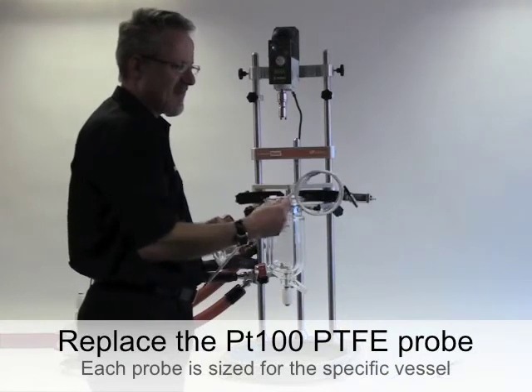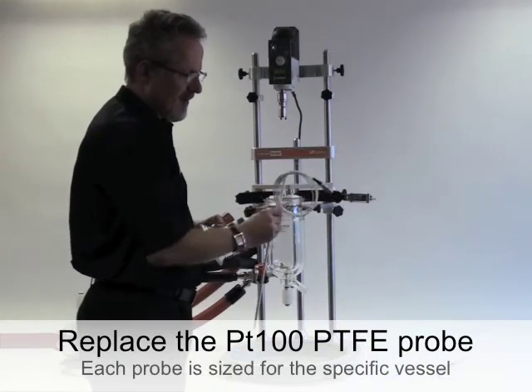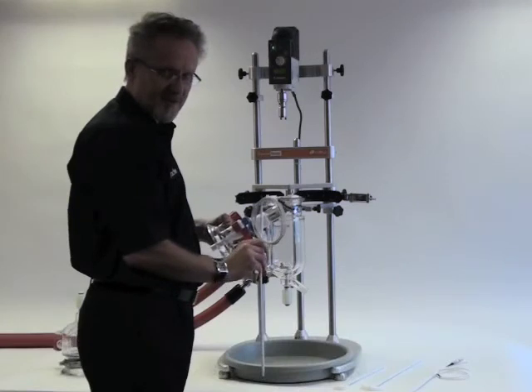This PTFE PT100 temperature probe is fitted with a limo plug for connection to the heater chiller.